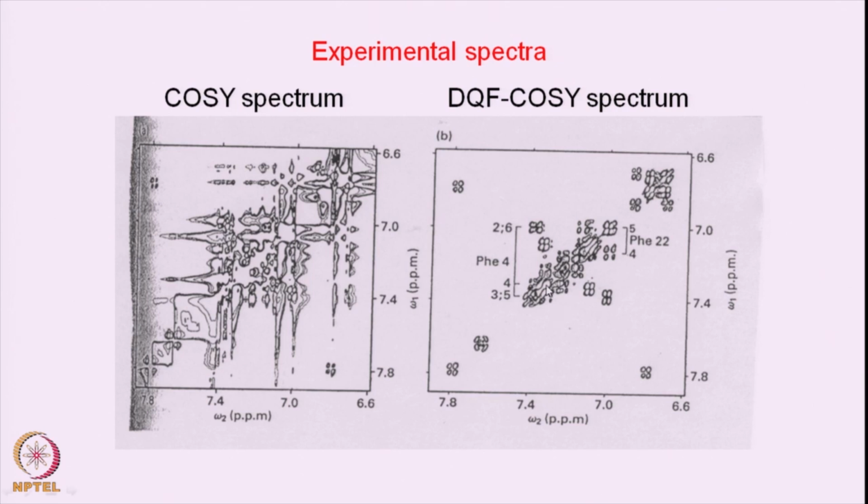Okay. So the double quantum filtered COSY on the one hand improved the resolution and allowed you to analyze complex spectra, and on the other hand it also demonstrated a strategy how to select particular pathways of magnetization. So we chose here a double quantum signal and converted the double quantum signal into observable single quantum by applying a third pulse, and therefore your pulse sequence was slightly modified. So this is a very general phenomenon. One can do this for various kinds of filters and also use this strategy for selecting different kinds of pathways.